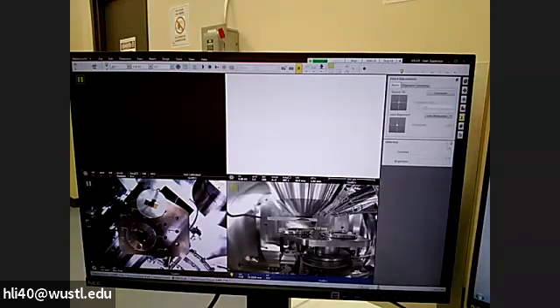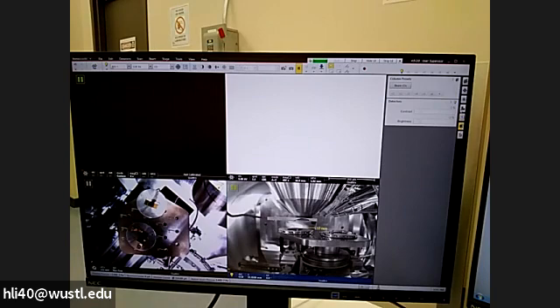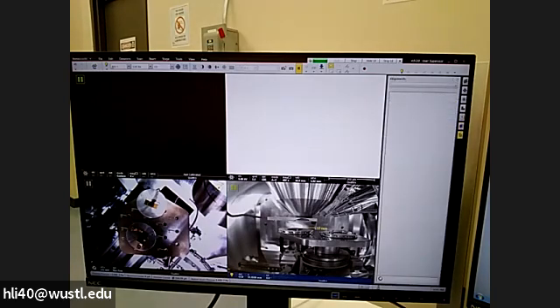The next thing is alignment. I don't need the user to do this type of alignment. This is for the engineer, or my alignment, if something changes. This is a preset, so I don't need to come here, and I don't need to come to alignment. So basically, you're playing with these 3 buttons, or maybe a little bit of the mini Photoshop here.